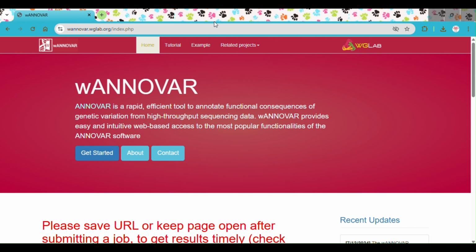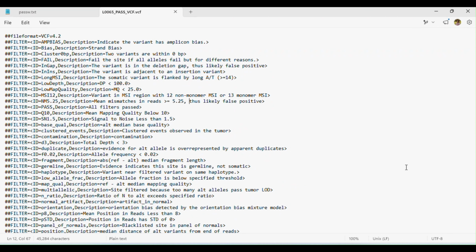So yeah, we are using the same VCF file that we used for the CGI analysis. But remember, CGI analysis only told us which variant is driver and which is passenger, which is not enough information. We need extra information to prioritize our variants and to work more on the variants which are actually pathogenic, and filter out the unimportant mutations, because usually in research we are more focused on the damaging mutations that actually damage the protein-protein interactions, and sometimes we filter for mutations that are involved in the pathways that we are interested in. So yeah, the extra information will really help us in that way.